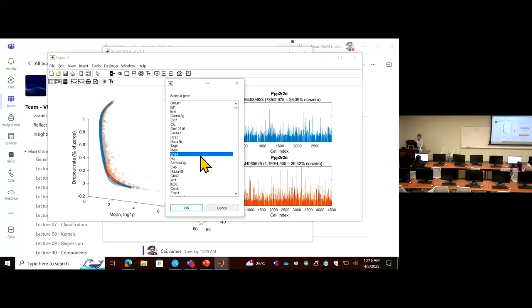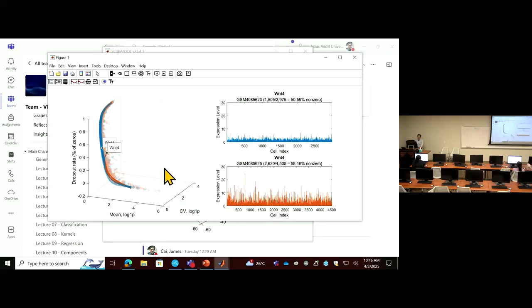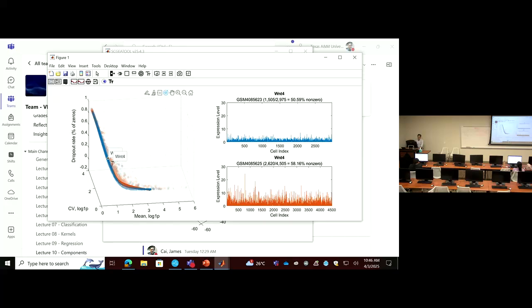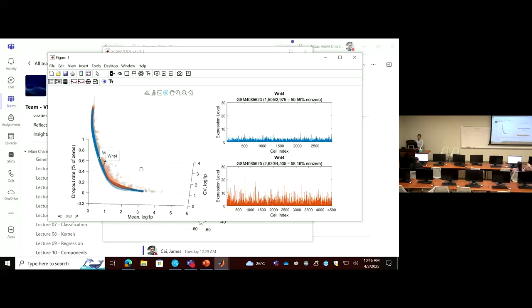Those are the top genes, and you may want to check them one by one. So for this one, the gene expression level is higher, and also the variability increased. So this is most likely to have some functional implications that make the orange sample different from the blue sample.